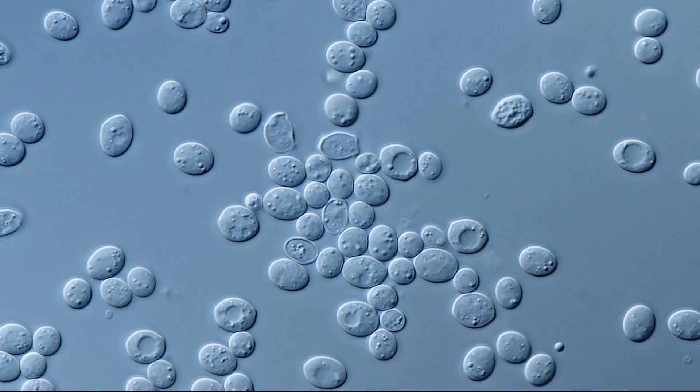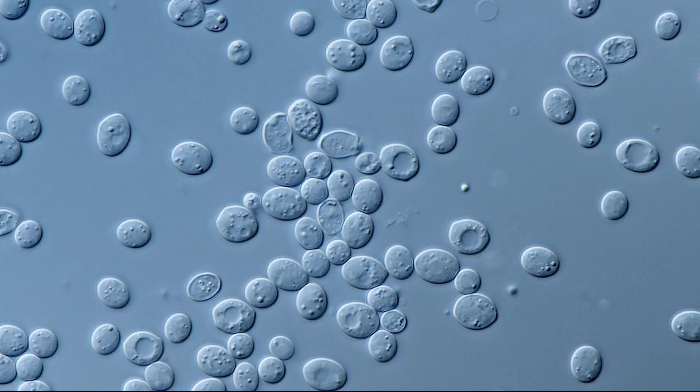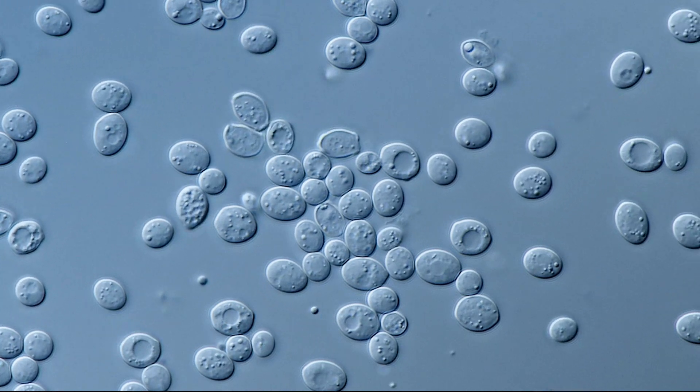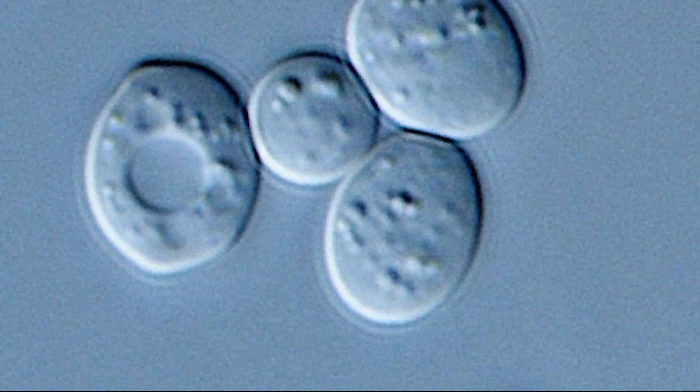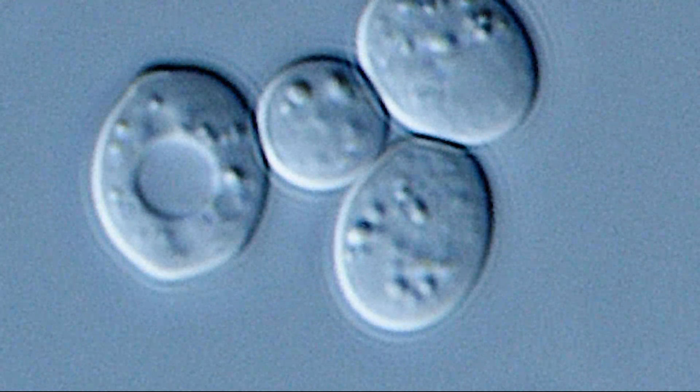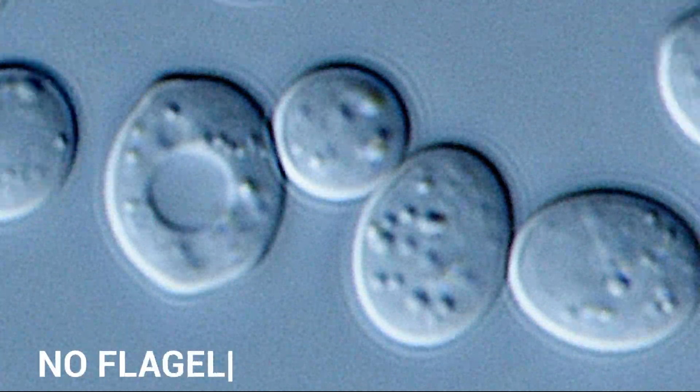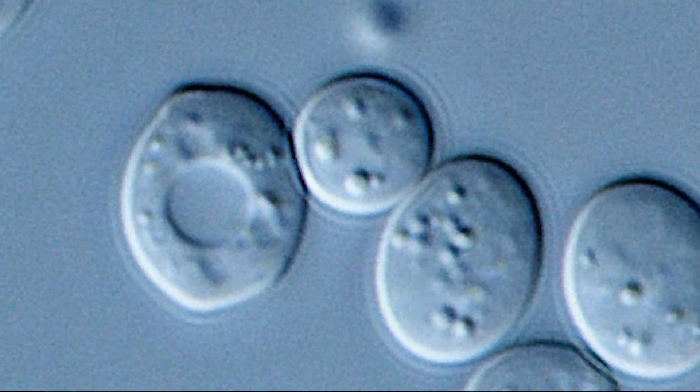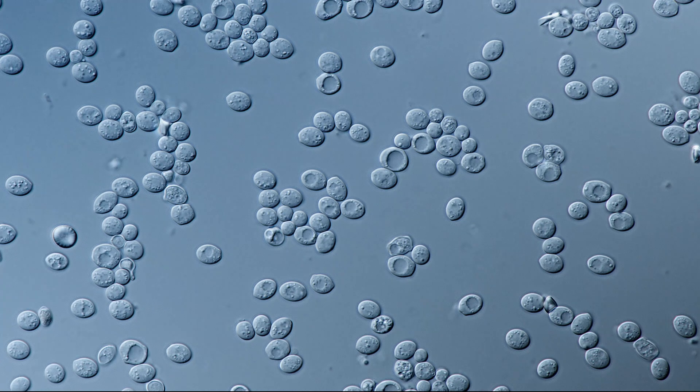In addition, yeast morphology is quite simple. They are generally larger in size than bacteria. Their size varies from 1 to 5 microns wide and 5 to 30 microns in length. Cells can be egg-shaped, some are elongated or spherical. Yeast cells lack flagella and other organs of locomotion. They simply don't move as other typical microbes found in wet environments.